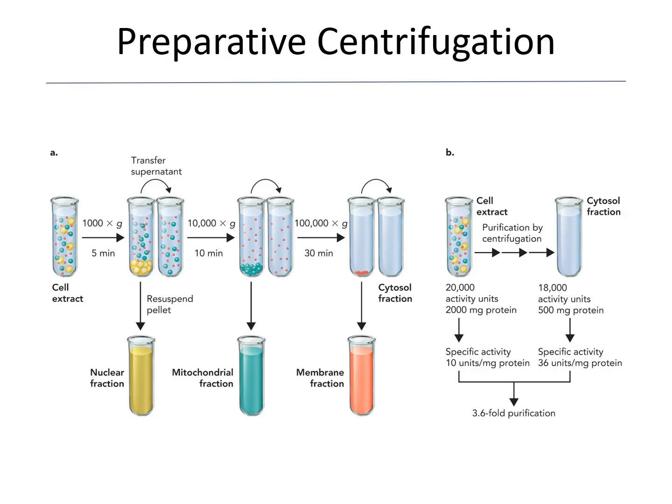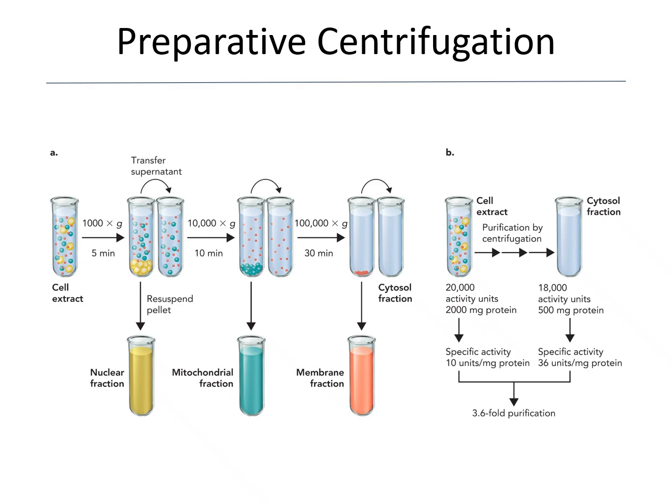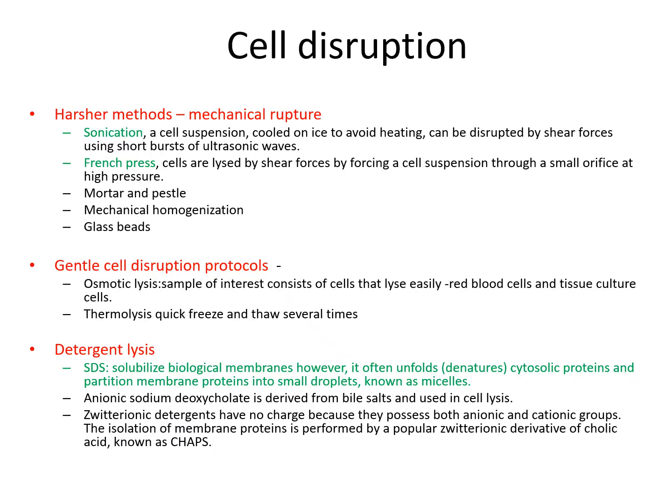Okay, so that's the preparatory centrifugation, and then using the differential centrifugation at different speeds and times to finally purify your protein. And of course that's the explanation to show you after the cell extract.